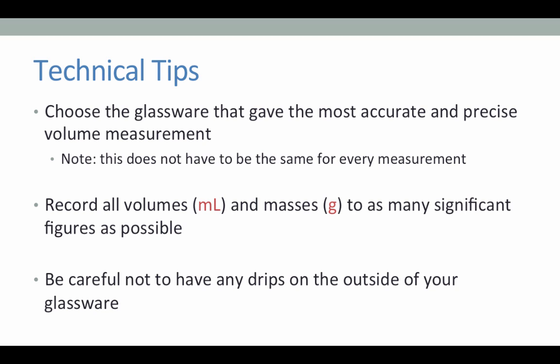Remember because you're taking the volume as the glassware gives it to you and then weighing the solution it's important not to have any of the solution on the outside of your glassware so take a kimwipe or a paper towel and wipe off any droplets that are on the outside of your glassware.